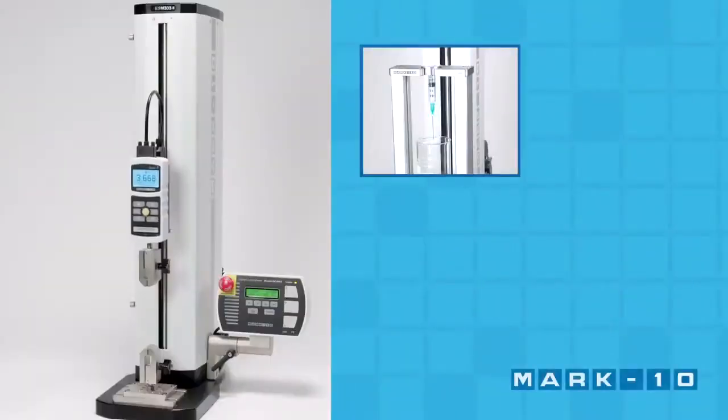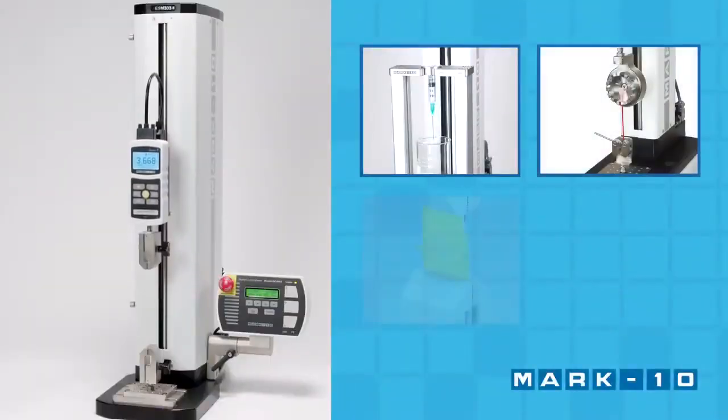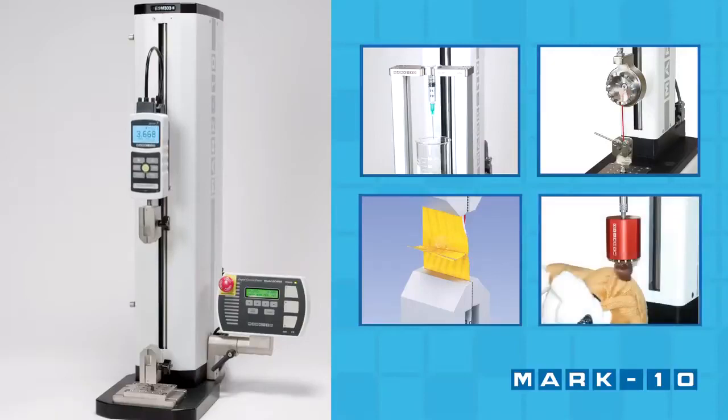From medical devices to automotive components, from packaging materials to consumer products, the tester is ideal for virtually every industry.